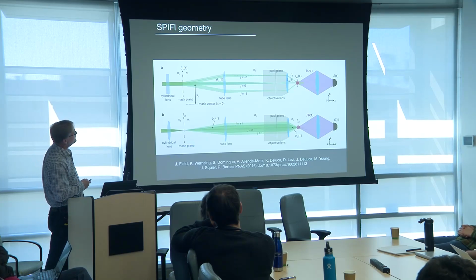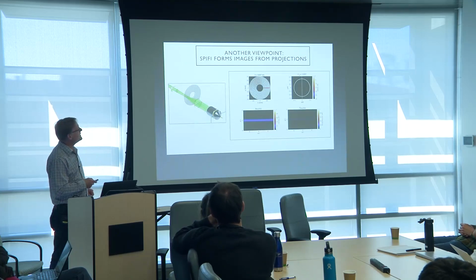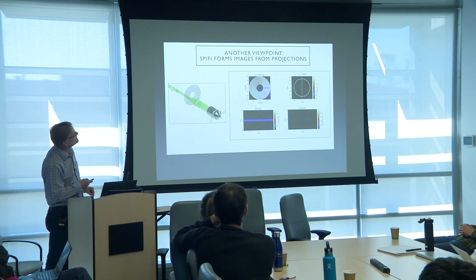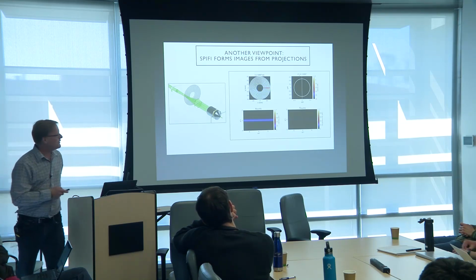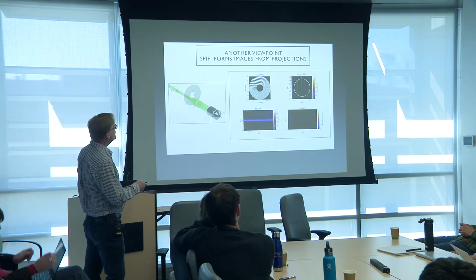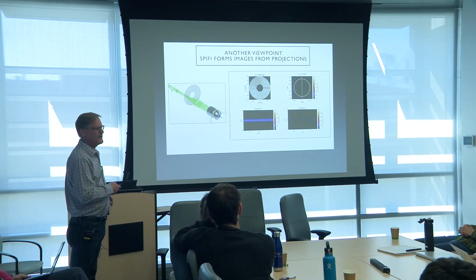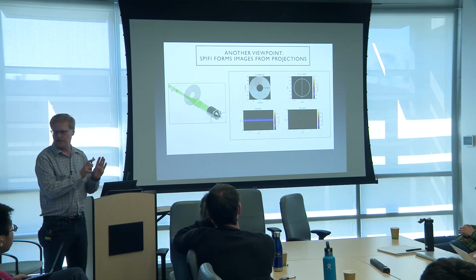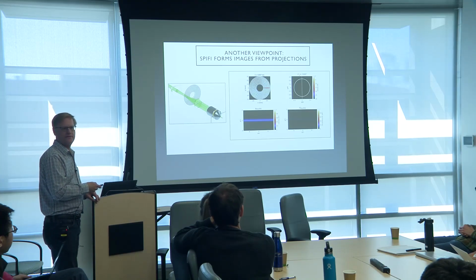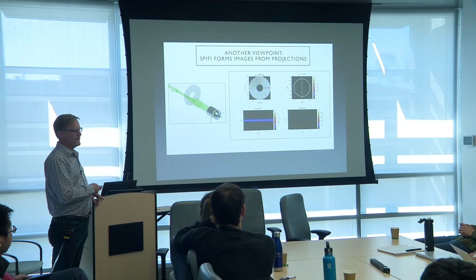And this is the side view. If you're looking down through the side, this is what the system looks like. This is just a movie to show you that there's my mask, and this is the entrance pupil to my optic right here. So you'll start to see the light sheets, what they look like projected on the back of the pupil. And now this is the intensity at that image plane.